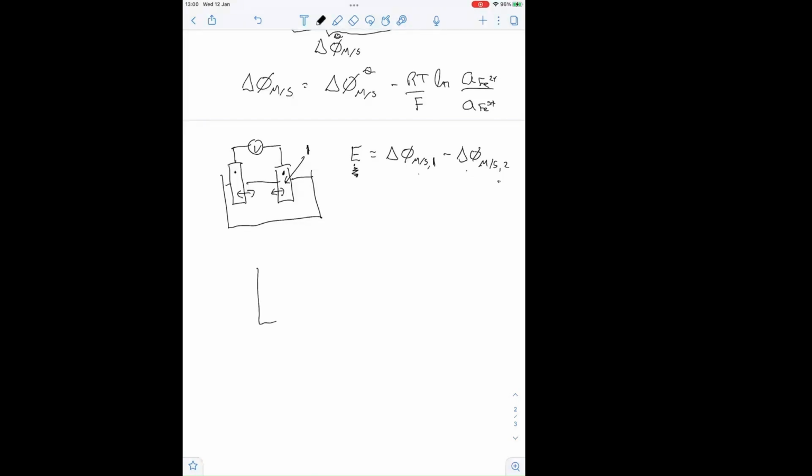So if I take a hydrogen electrode, this has platinum black on the surface, which is just porous platinum, and we surround it. So let's put a jacket on there, in which we're going to bubble hydrogen. So we put hydrogen in there at one atmosphere pressure.